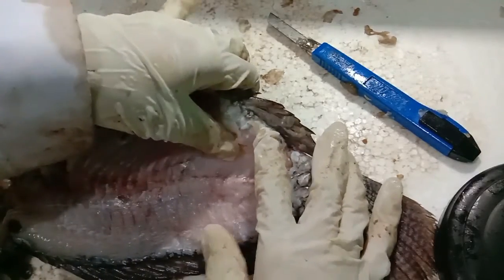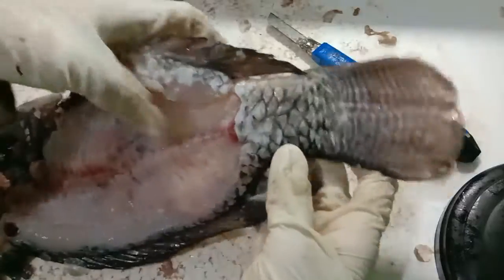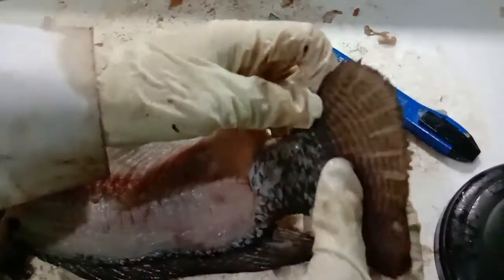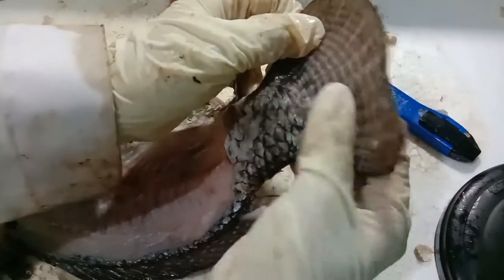The next is the last part of the skeletal system. It is the caudal fin ray on the tail.